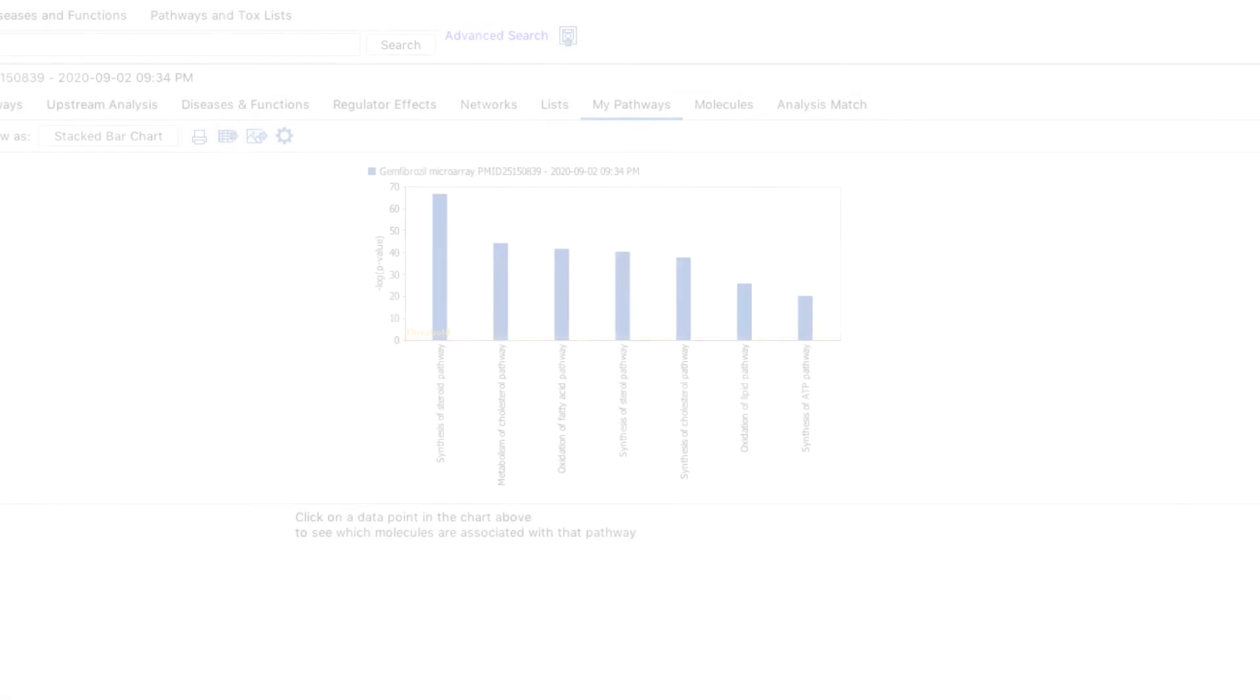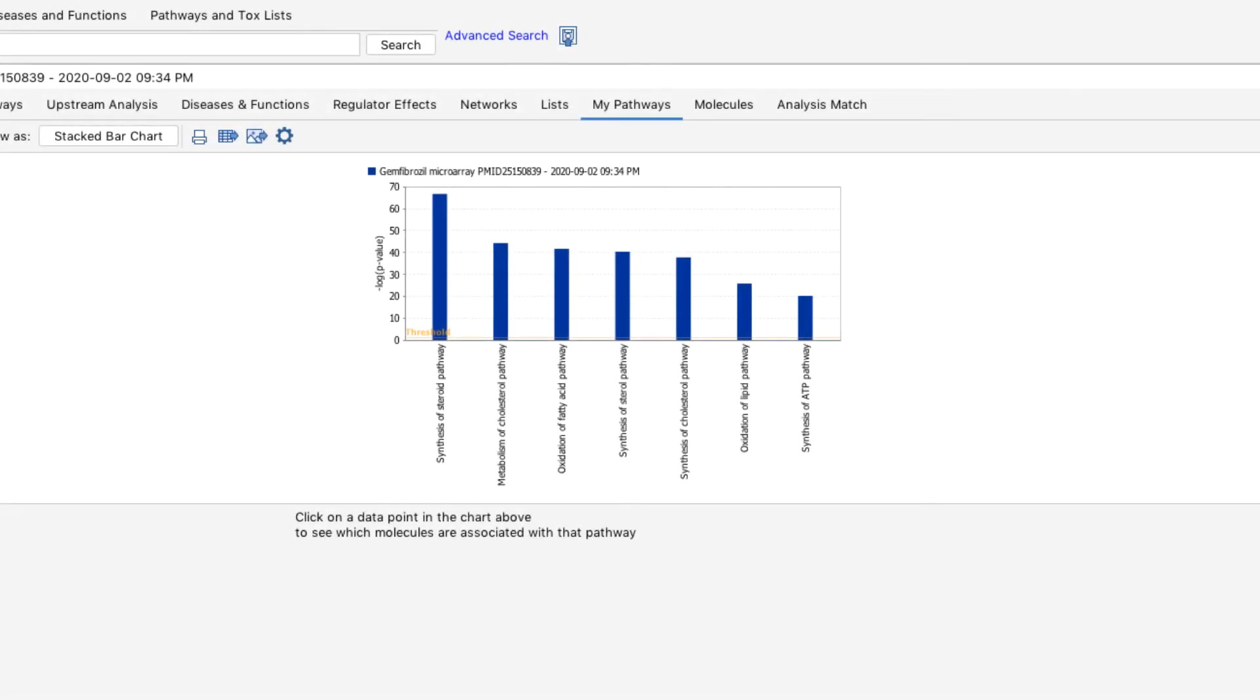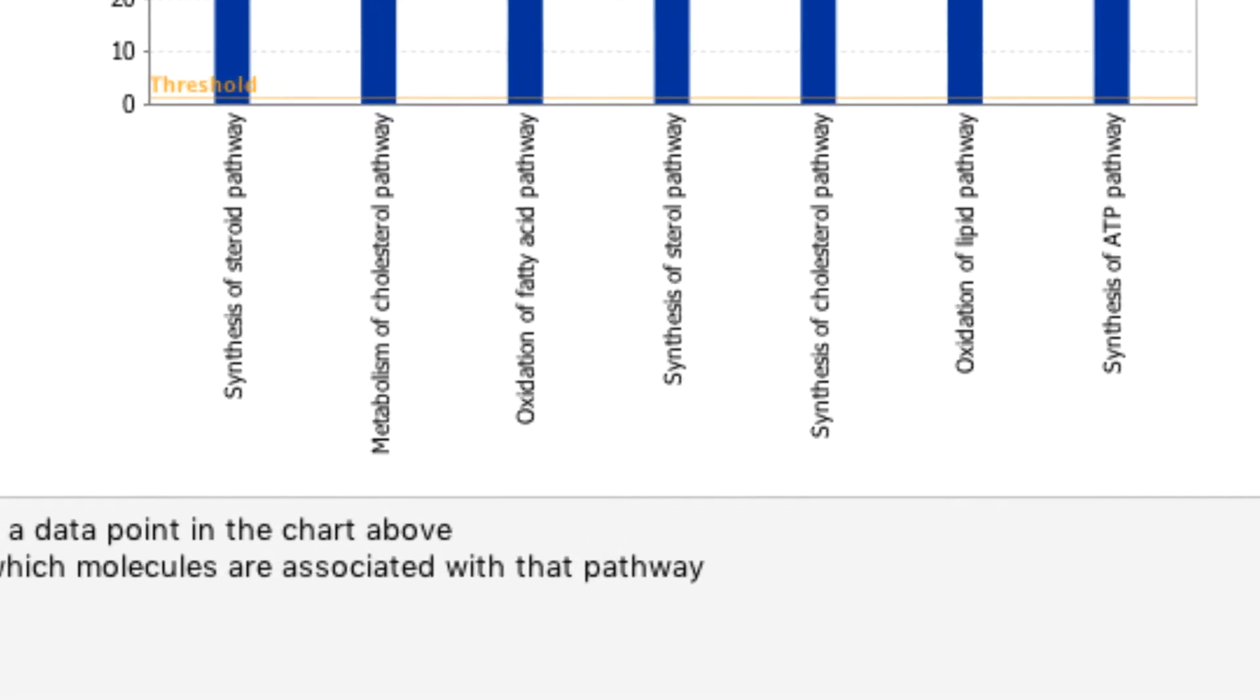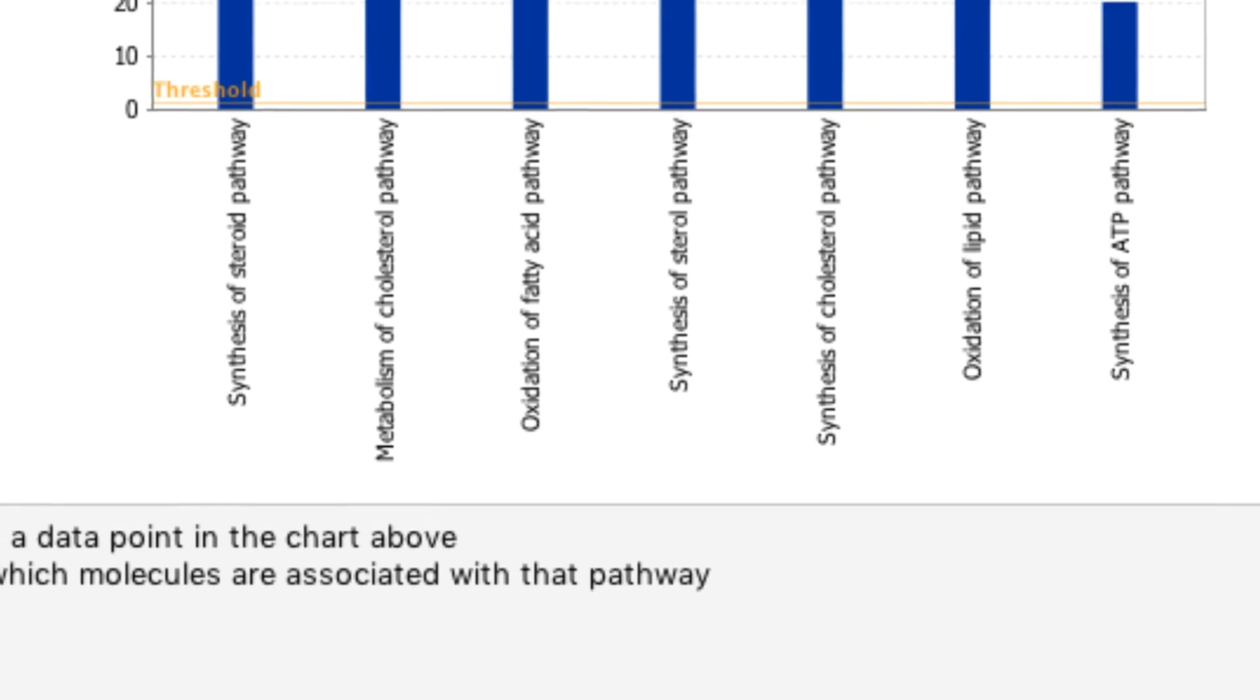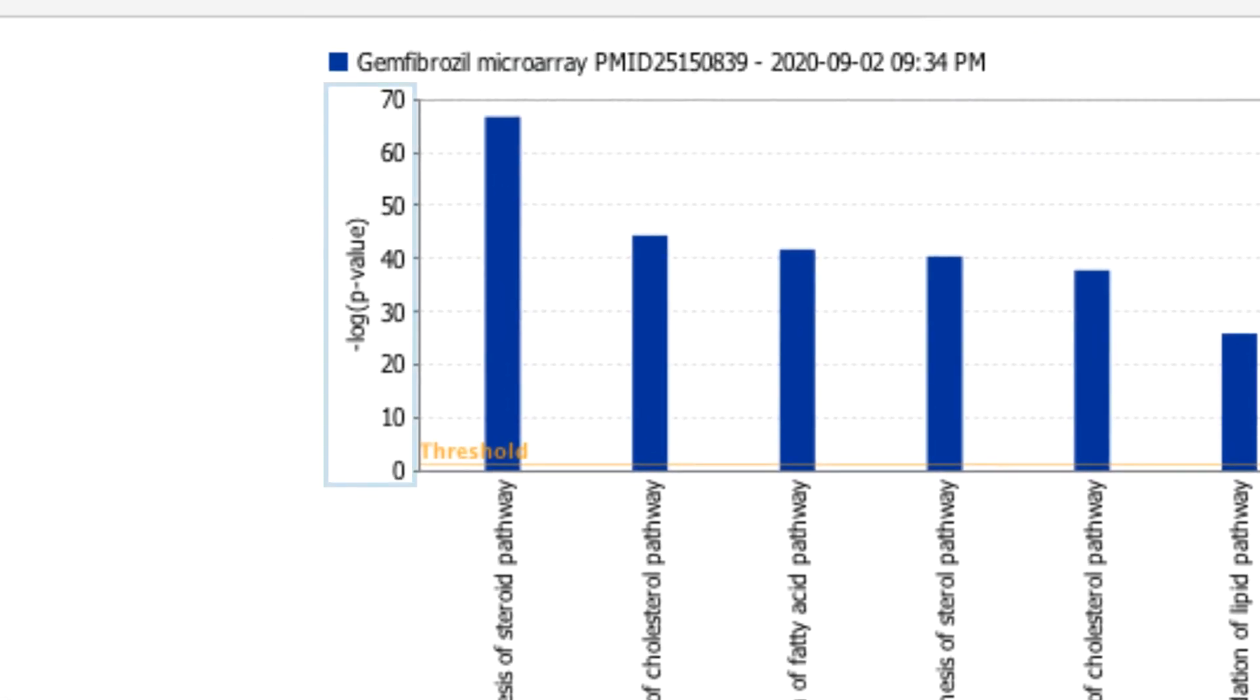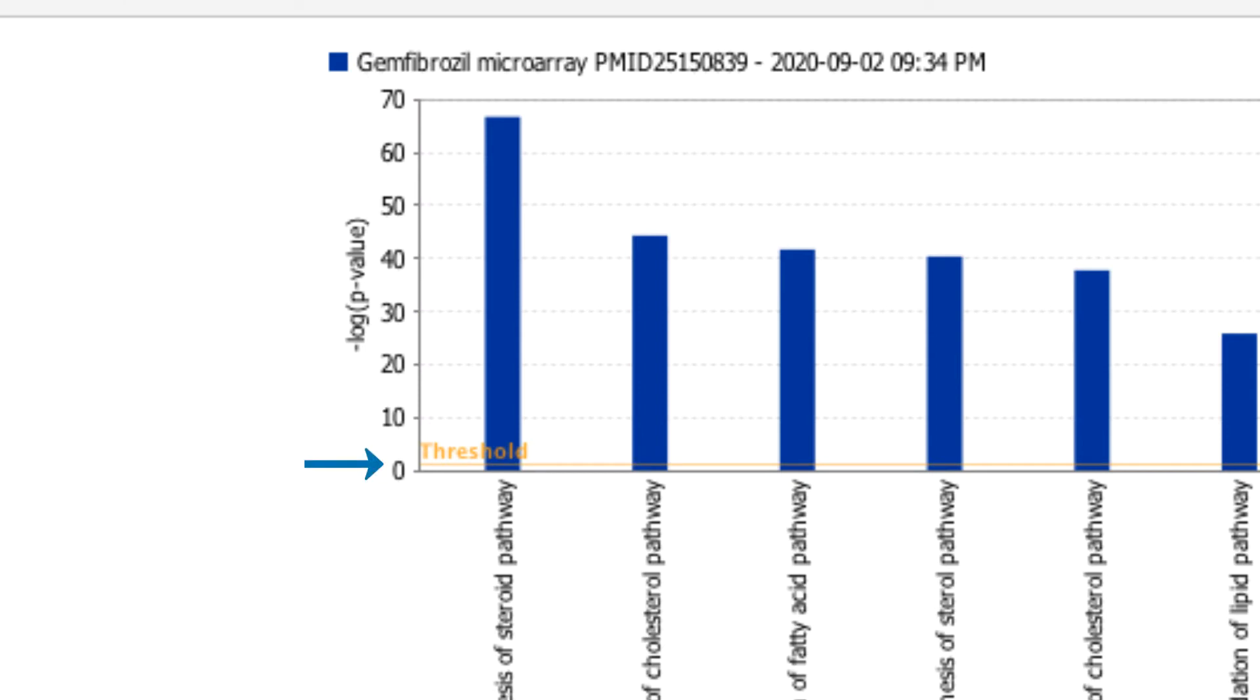The MyPathways results appear in the form of a bar chart with the name of your saved MyPathways on the x-axis and the negative log of the p-value of overlap on the y-axis. The threshold line represents the statistical significance threshold of 0.05, whose negative log is 1.3.